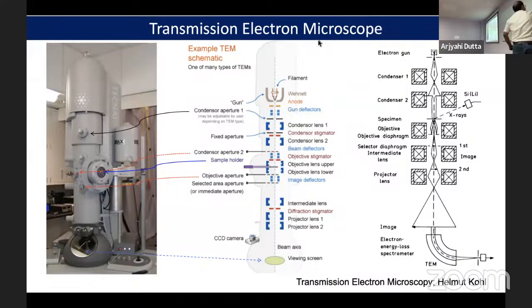So we have a light source, it is coming, and there is a crossover point. If we just use more and more lenses, here, if we consider this is one lens, and then second, and then third, then fourth. If we just go like that, you can easily magnify something. Then you can see any small things. Then that is true for the light microscope also.